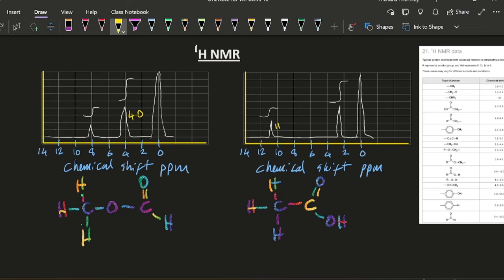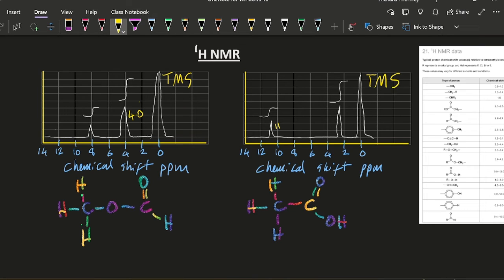First of all, we can ignore the TMS, tetramethylsilane, which is at zero. That's just a solvent. Looking at the vertical parts, that's a one to three ratio. And that's a one to three ratio.